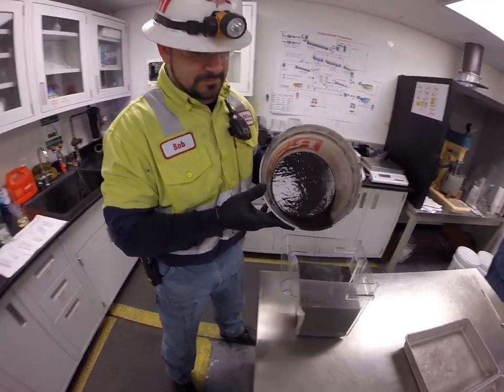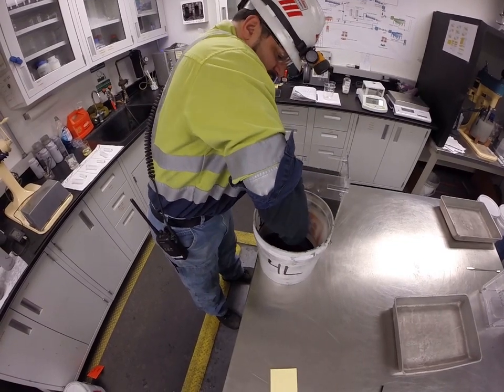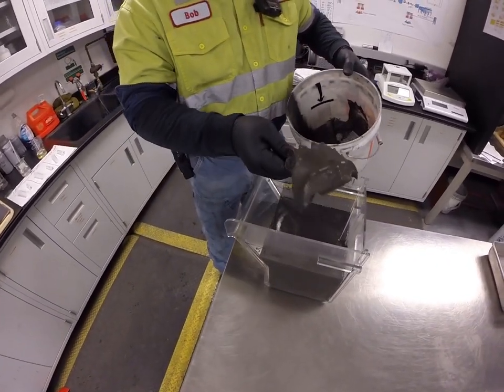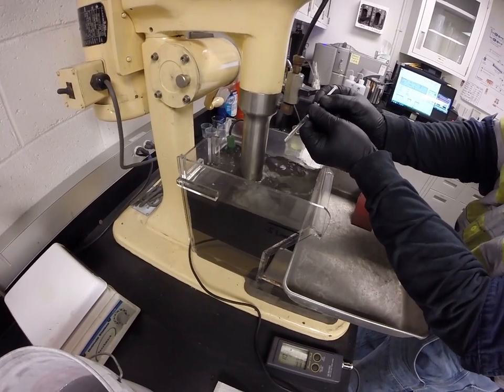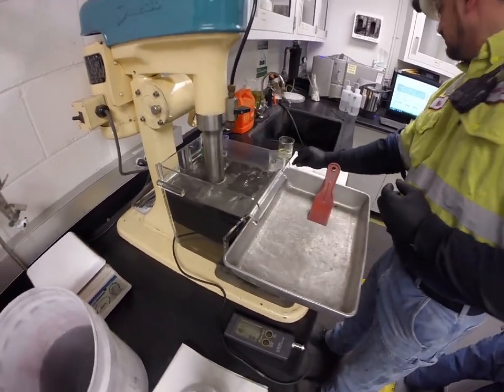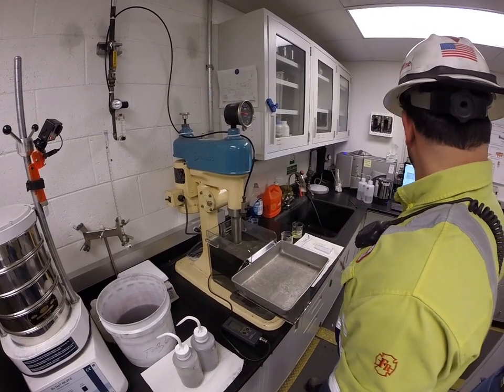So we pour it into here. The first segment is a baseline where we take conditions in the mill that we're floating with right now, and then just run it to see where we're at. Then in the next four steps, what we do is change the chemicals that we use as far as the suppressants, frothers, and dispersants, so we can either try to use less or maybe come up with a better chemical down the road.